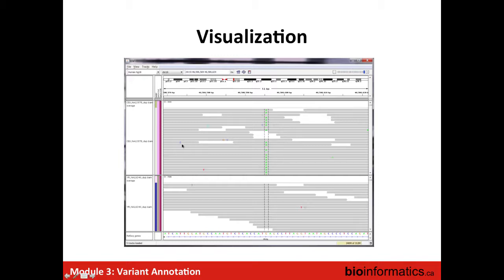And then you've got the mismatches. There are different views, but in this particular view, when there's a mismatch, you actually see the letter that's at a specific position. So from this, it's quite clear that you've got some errors in your reads at the rate that's expected, while the variant that we're looking at really stands out as being very clear.